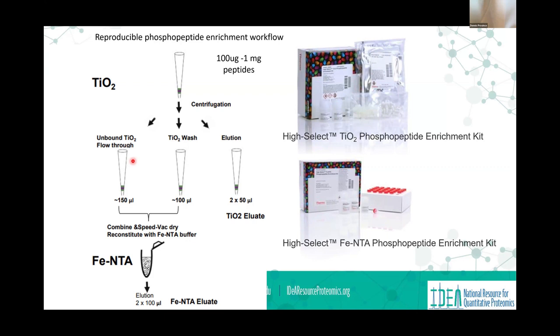And so you can do phospho enrichment. You can buy resin and do it on your own. These kits work really well. It's a little expensive, but it's within reason. And one of the things that I like about it is the coordination chemistry between titanium and iron is very similar. You're binding phosphopeptides, but sometimes interferences in the sample can affect how one works versus the other.